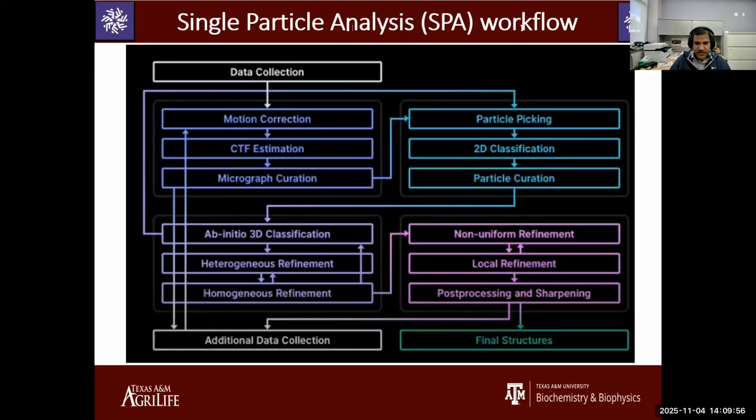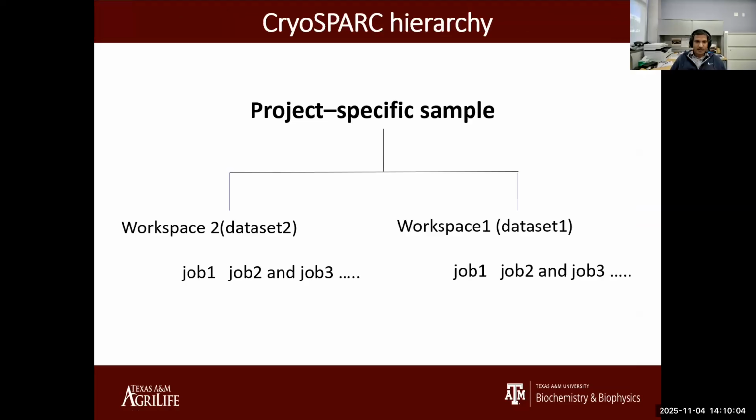That usually helps if you have good particles. If you have a lot of heterogeneity, you can still sort it out. In most cases it works, but there are some cases where it will not necessarily work.